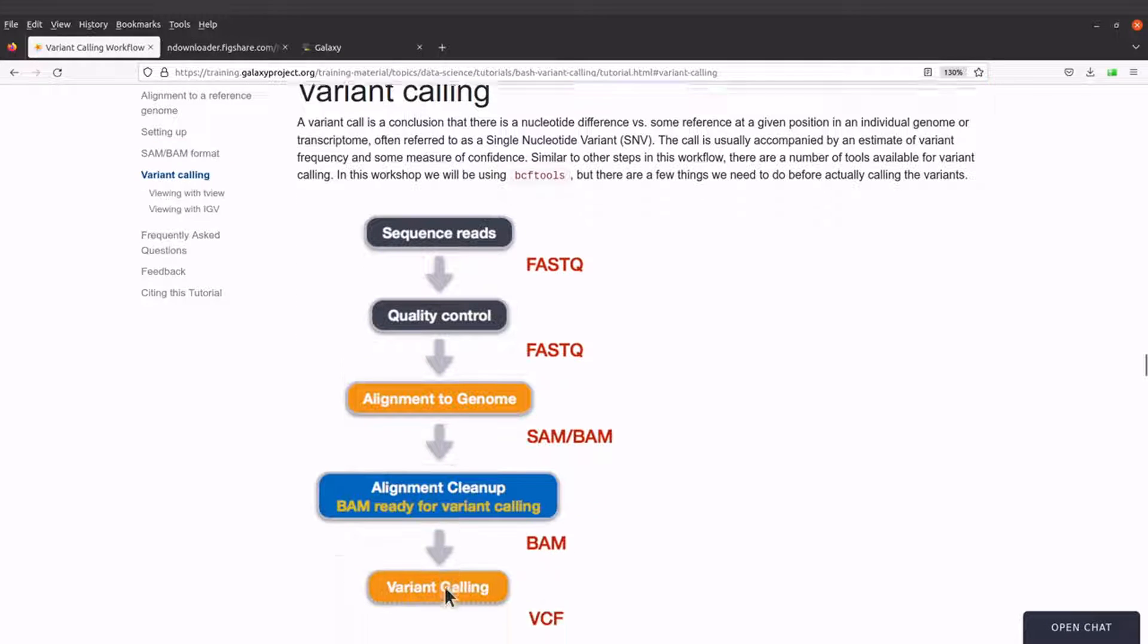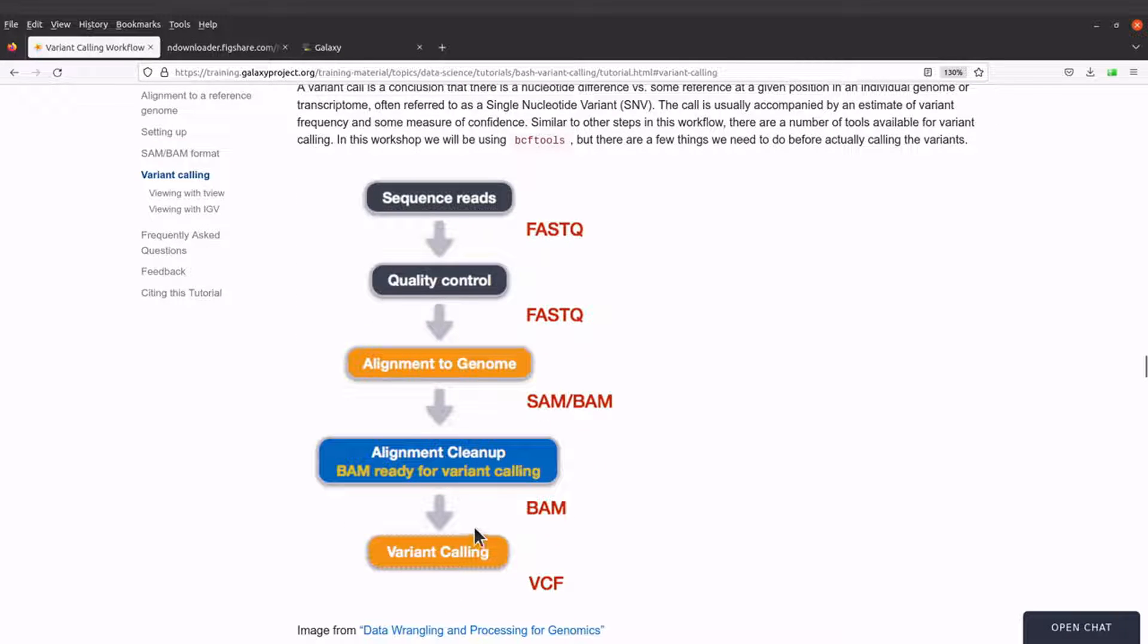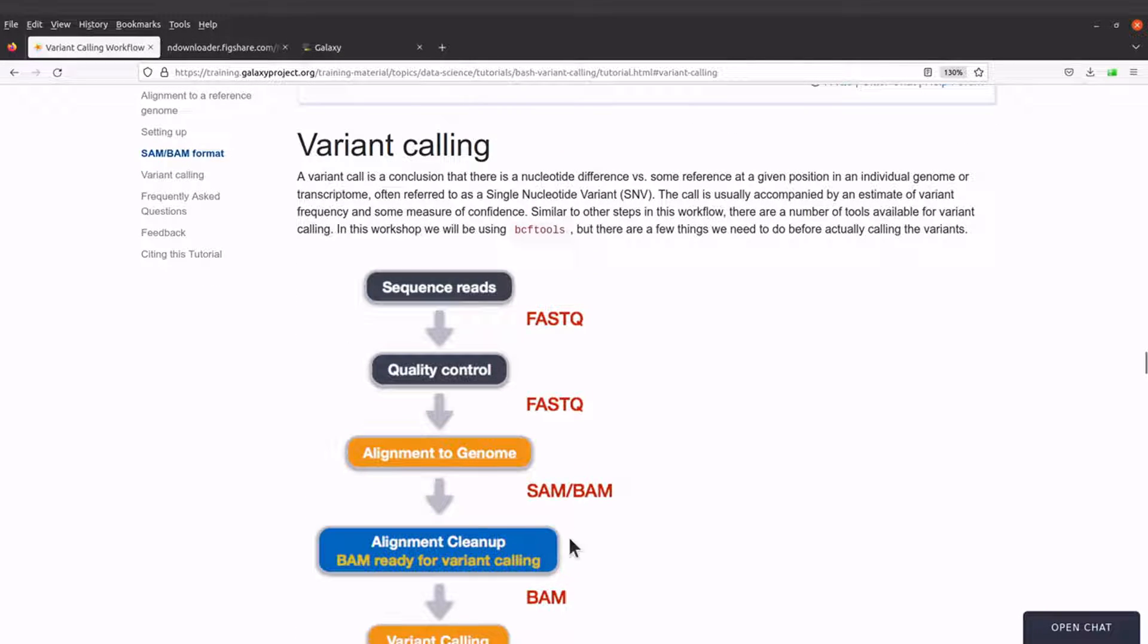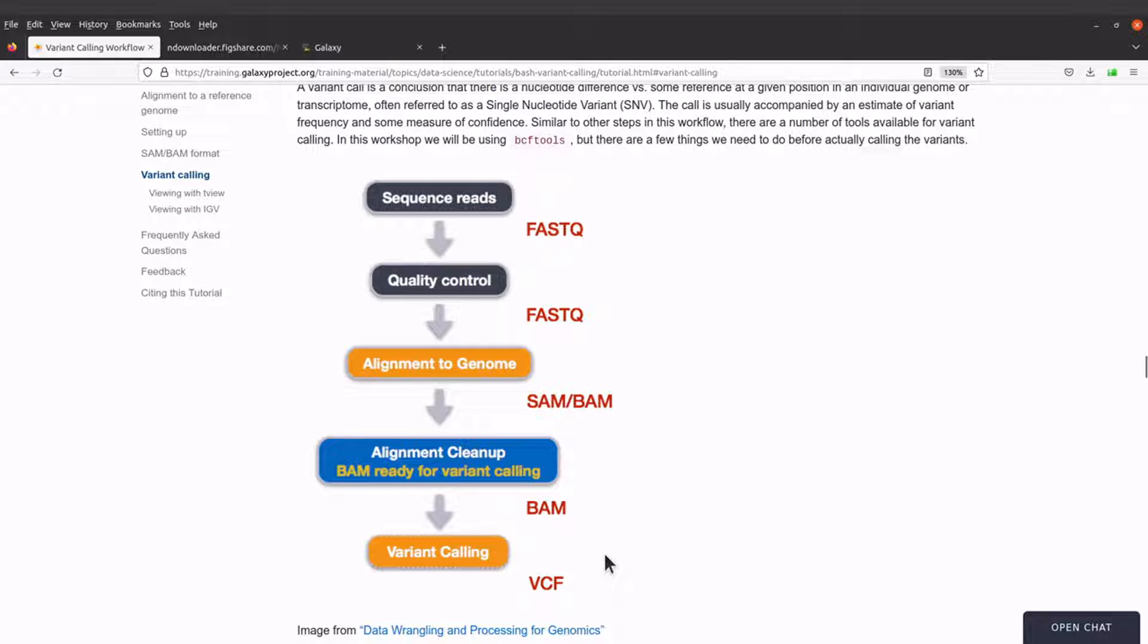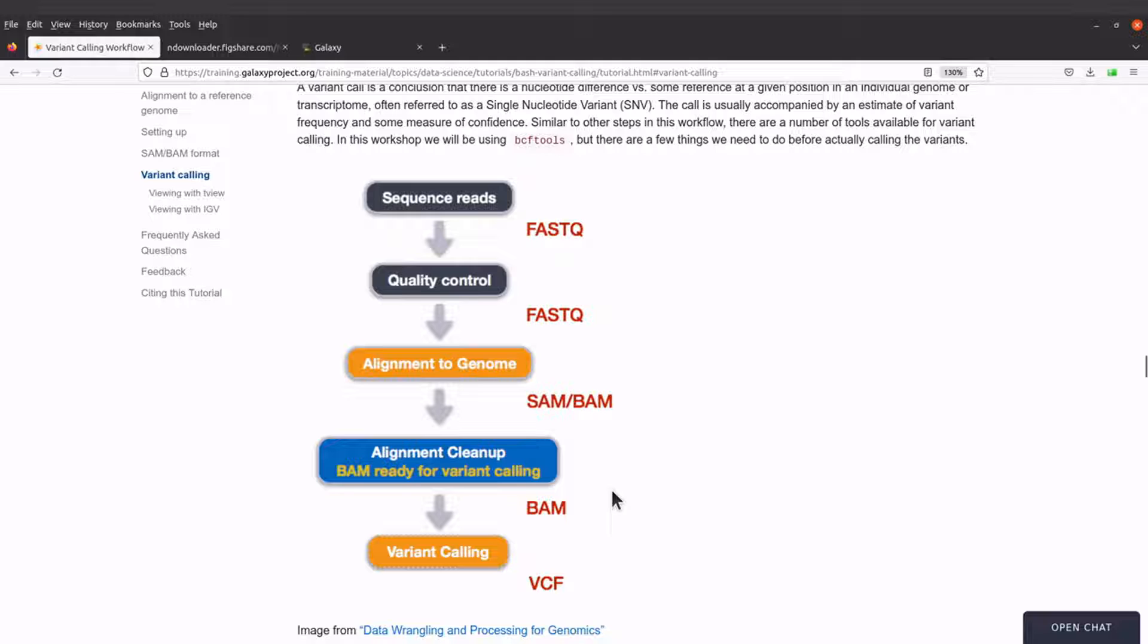Okay, so the next step is variant calling. We will continue. We should have done alignment cleanup but we are skipping that because that is not the focus of this tutorial, so take note of that.